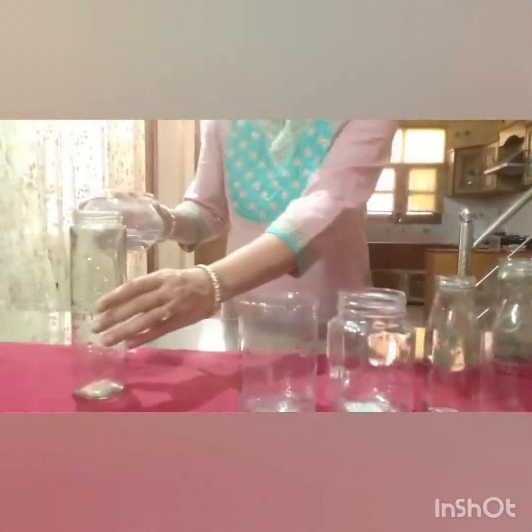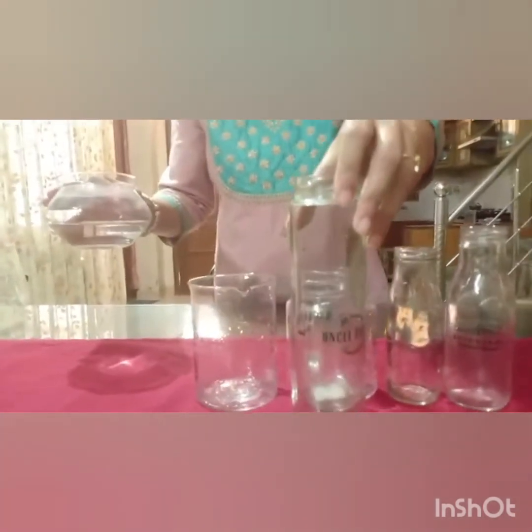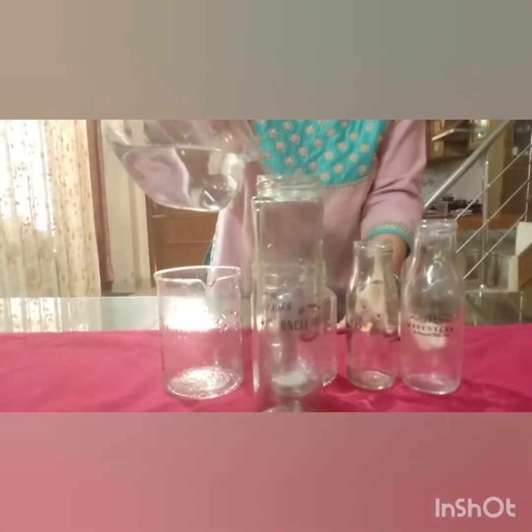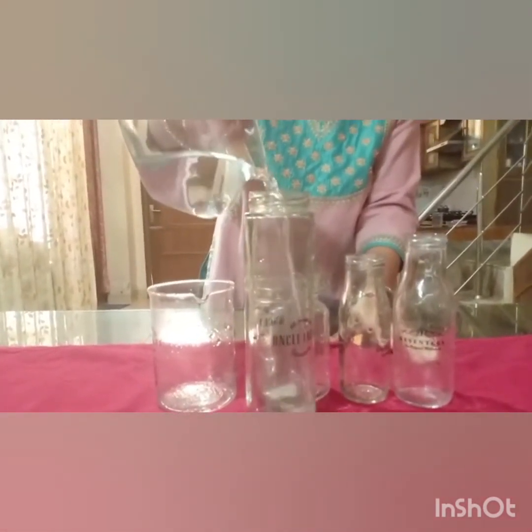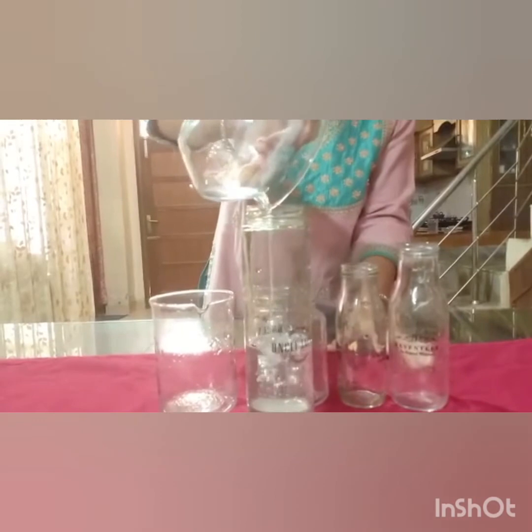Now finally I will pour this back into my measuring cylinder. Let's see whether the water gets the same volume or not. You have to be very careful that no drop of water is wasted.